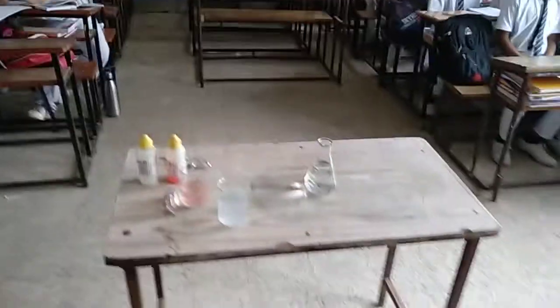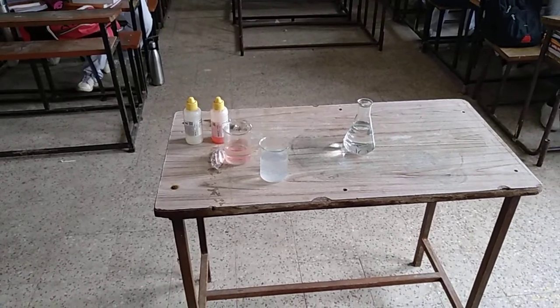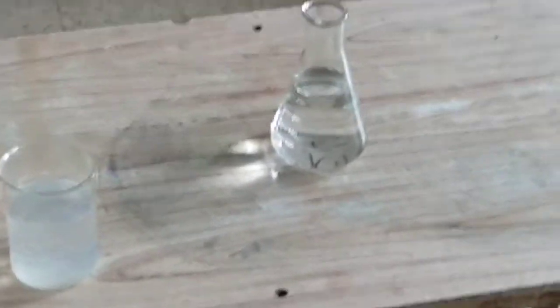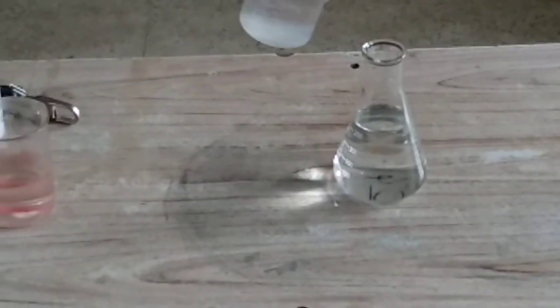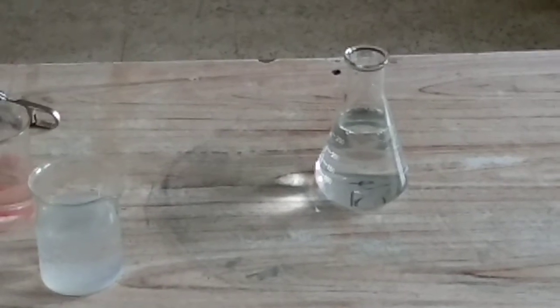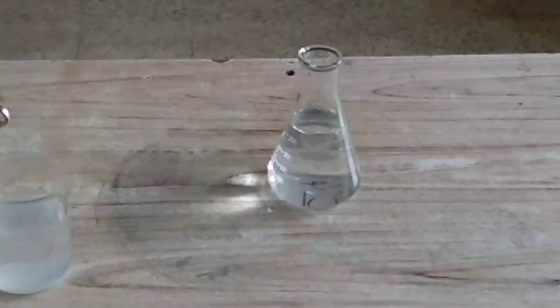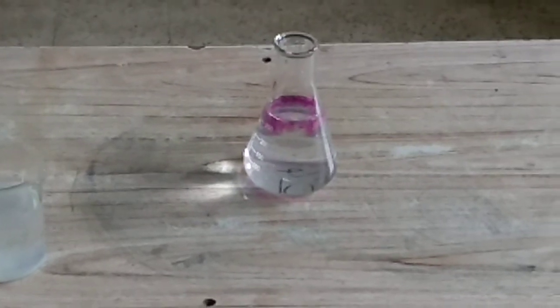Roll number seven, add base into it. Now you need to identify which one is base. Add three or four drops. Now add one drop of phenolphthalein into it — one drop only. Mix it well.